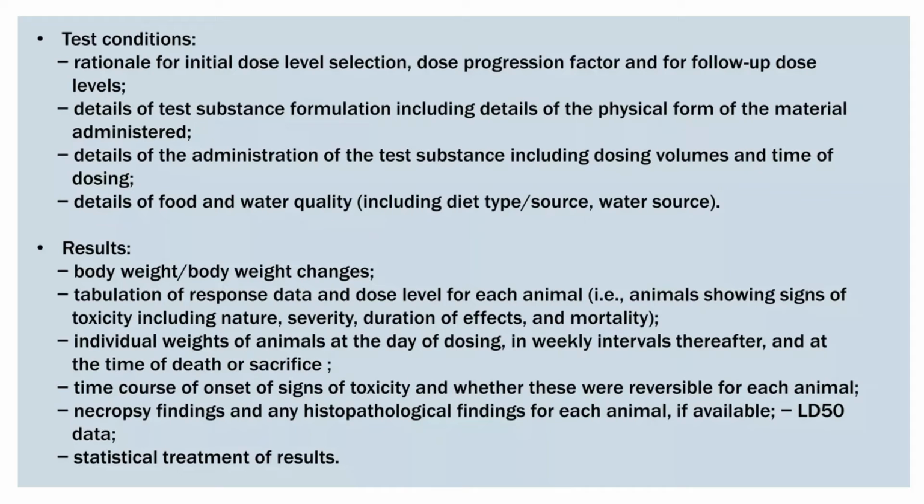And the test conditions: rationale for initial dose level selection, dose progression factor for follow-up dose levels, and details of the test substance formulation including details of the physical form of the material administered, and details of the administration of the test substance including dose volumes and times of dosing.